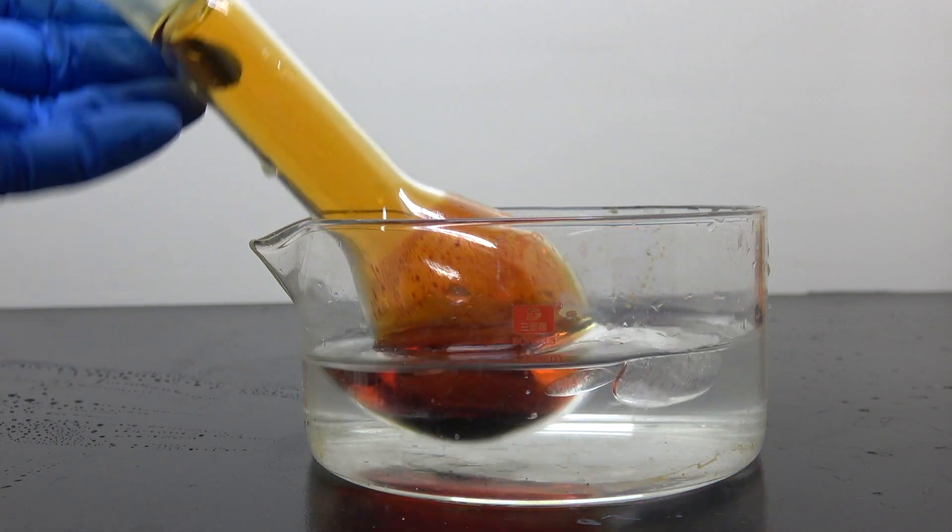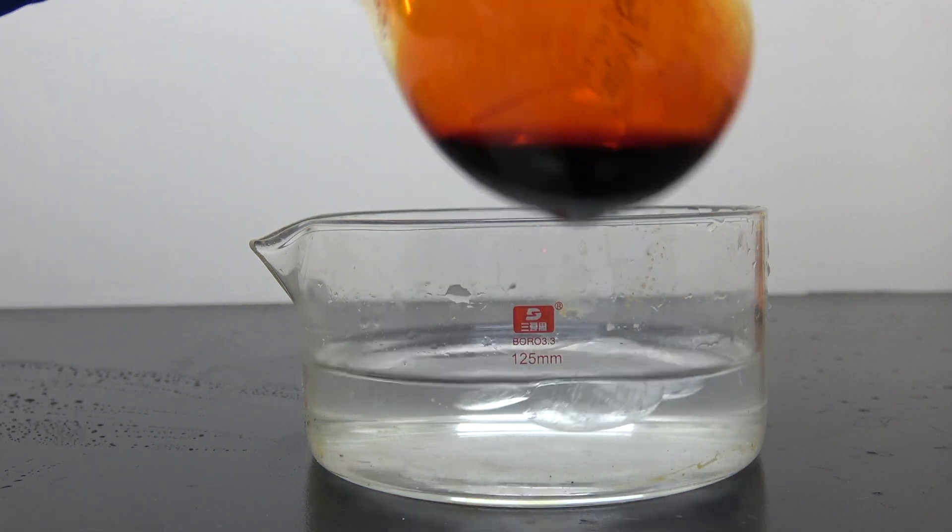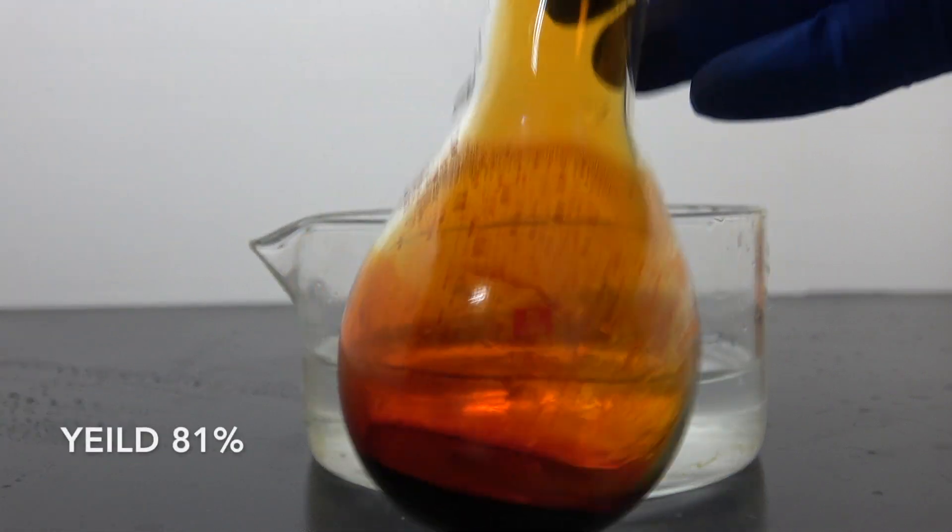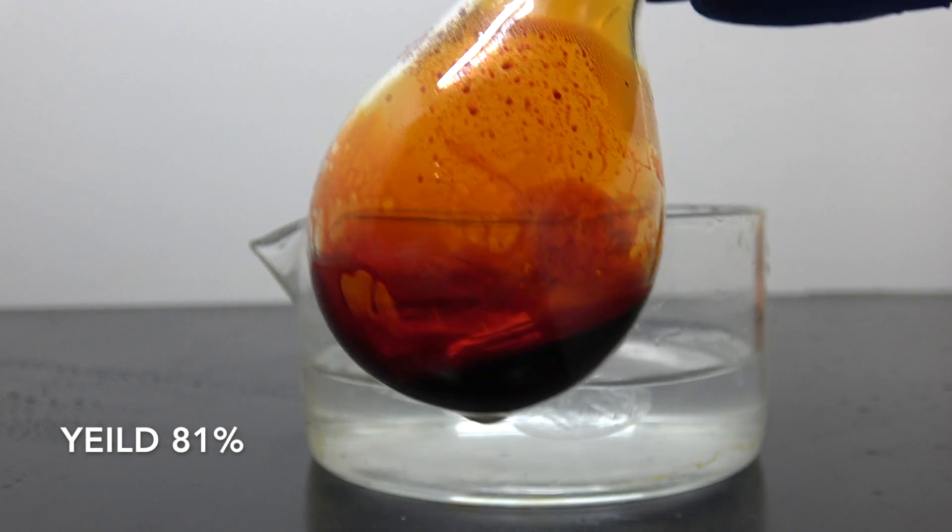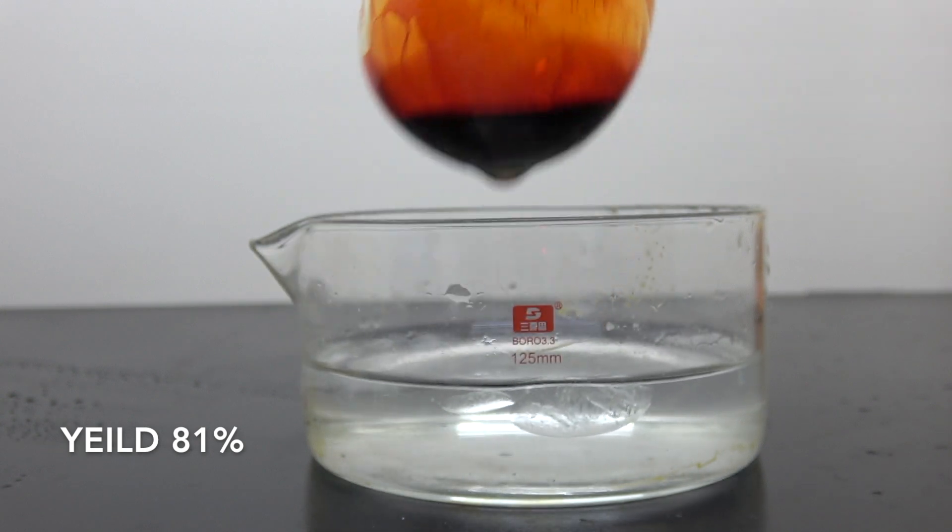Here is the final product, about 20 ml of elemental bromine. This represents about 81% yield according to sodium bromide.